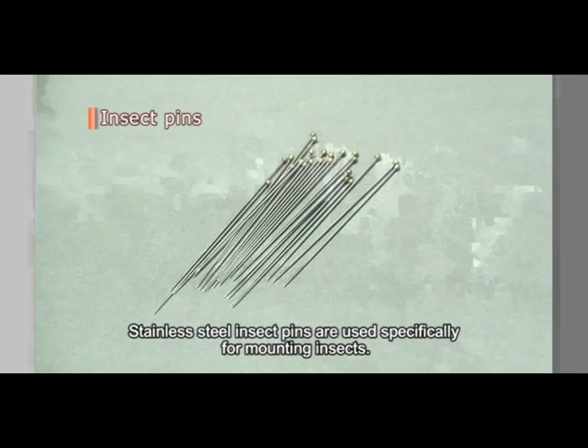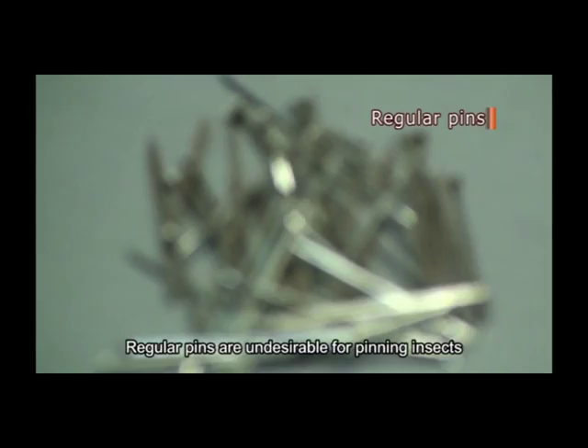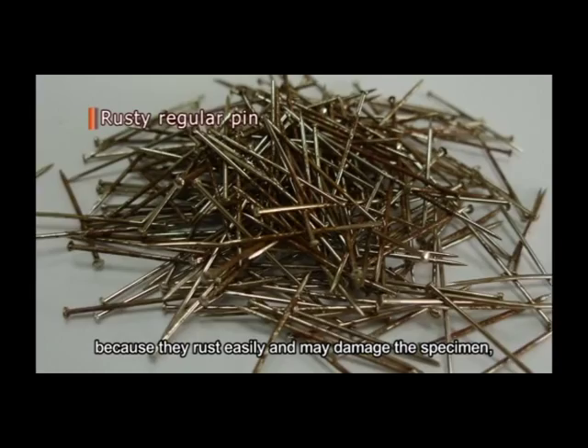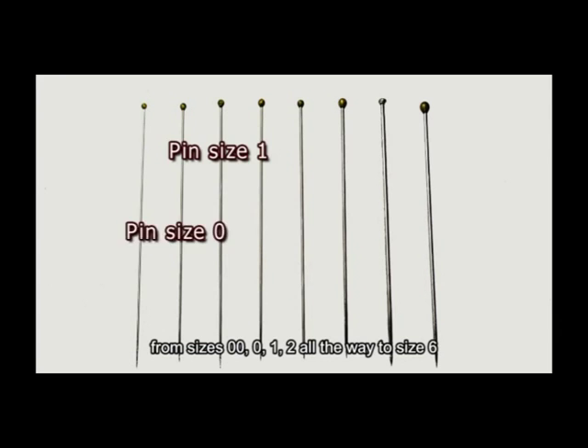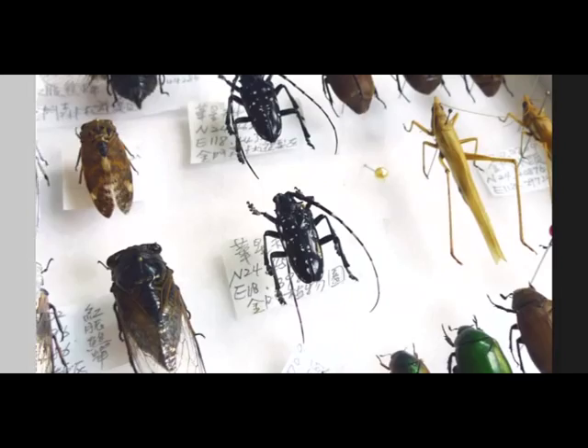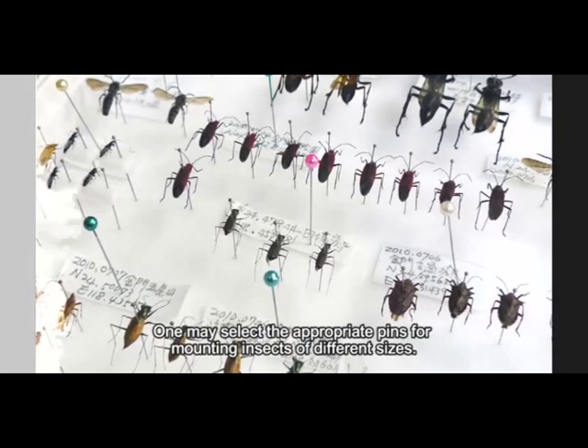Stainless steel insect pins are used specifically for mounting insects. Regular pins are undesirable for pinning insects because they rust easily and may damage the specimen, thus reducing the value of the specimen. Genuine insect pins come in several sizes, from sizes 00, 0, 1, 2, all the way to size 6.